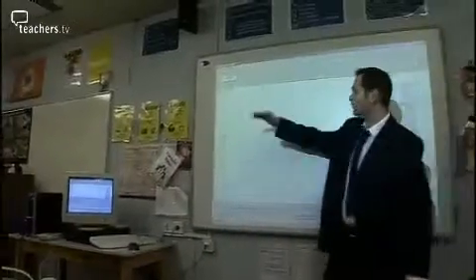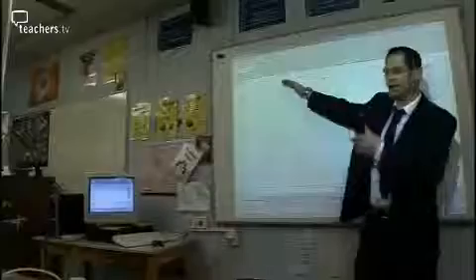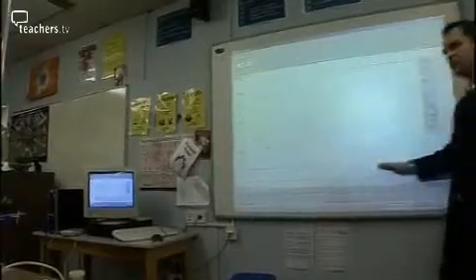That's fantastic. Well done. Absolute reverse. And for very good reasons. The pH would be high, then it would, just like it does here, rapidly drop down, and then you'd end up at a low pH.